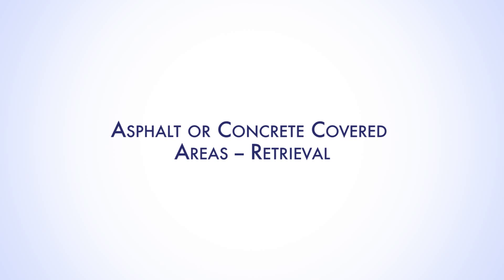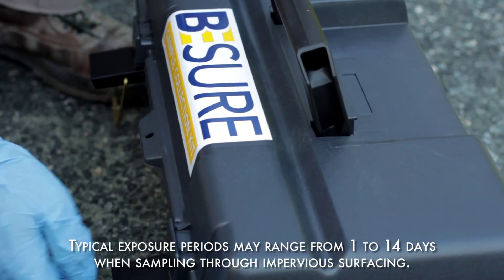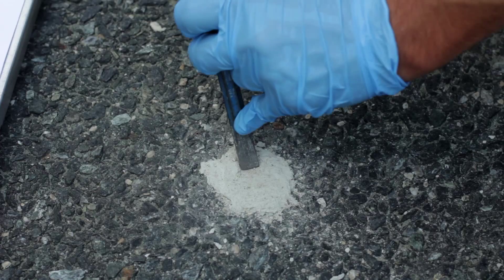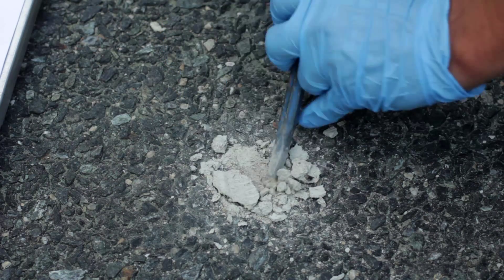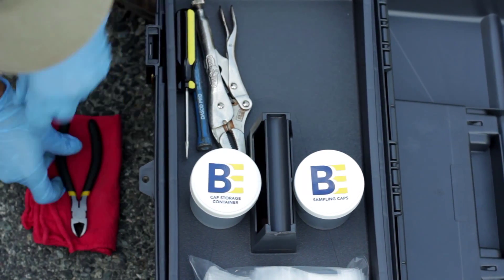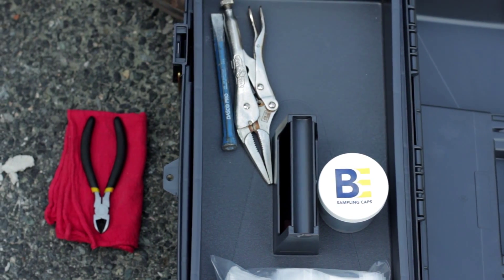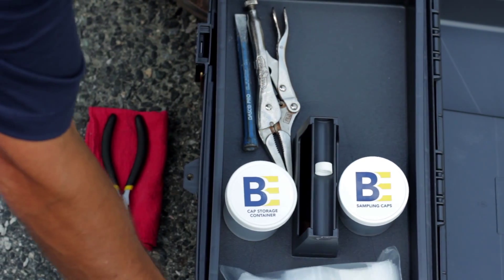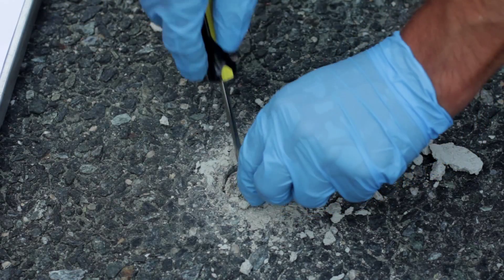Following the exposure period, return to the sample location and place the kit next to it. Use a small chisel or screwdriver and hammer to remove the concrete patch to expose the aluminum foil — the concrete patch is easily chipped out of the hole. Next, with the field kit open, place a clean cloth or paper towel, wire cutters, and screwdriver next to the sampling hole. Remove a solid shipping cap from the cap storage container and place it and a square of gauze cloth on the open kit. Remove the aluminum foil plug using the small screwdriver.